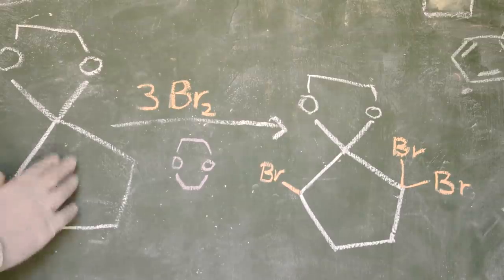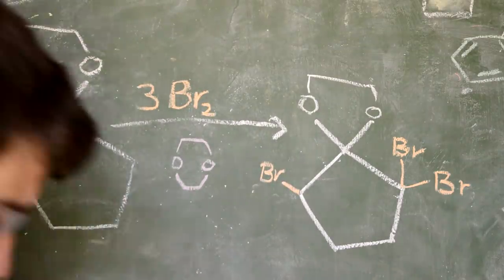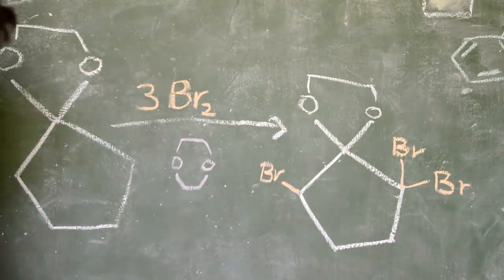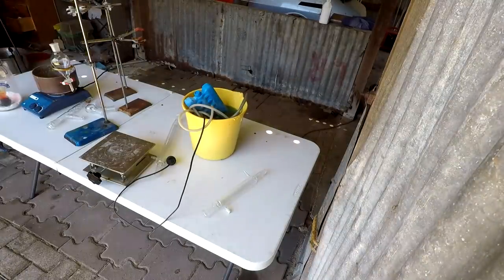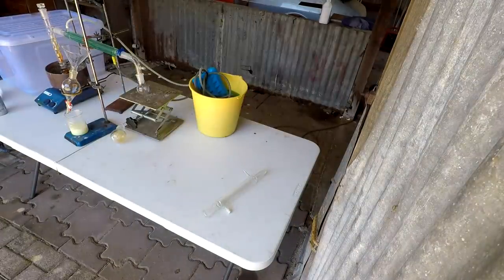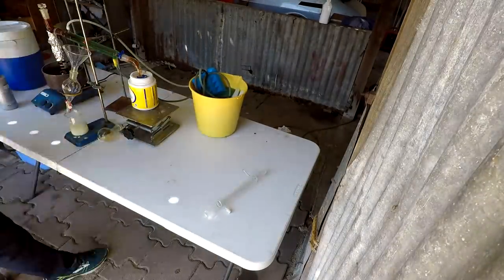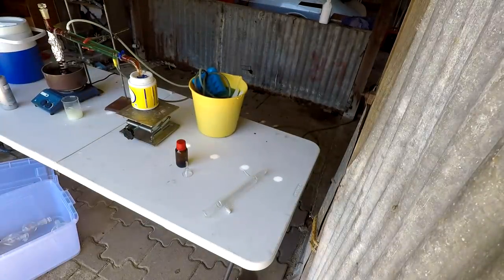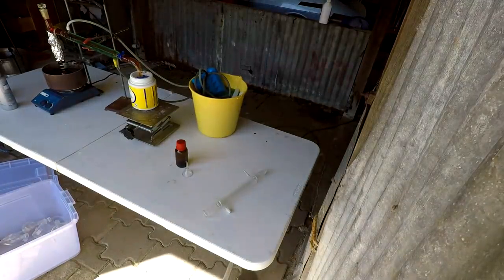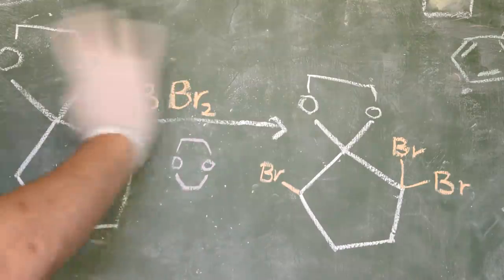As I've mentioned and re-mentioned, the difficult part about this is the fact that it has to be dry. I'm actually going to dry that out over some sieves before we run this thing. I have redistilled the bromine. That was something I didn't mention last episode. It took a lot of time, but it's there. So the bromine is dry. Well, everything is dry, but we'll just overdo it with some sieves because this is particularly water sensitive, and dioxane does tend to absorb water from the atmosphere over time, and it's been a little while since I made it. So yes, anyway.